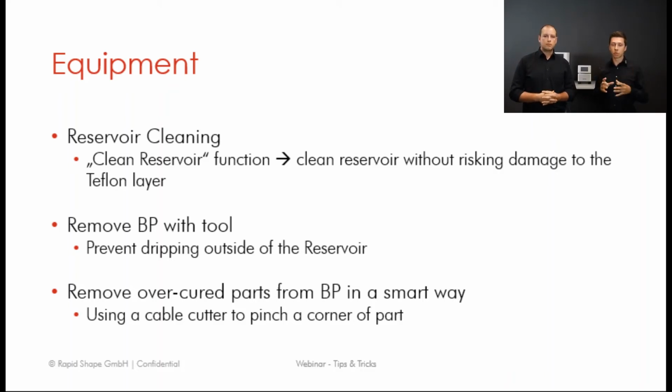If you forget, for example, to put in a platform, but you adjusted the screw too much, the load cell is not measuring the force on the back, it's measuring on the front. But the back side will collide with the reservoir, for example. So if you are adjusting something there, just get in contact with us. We will assist you to get the right amount of adjustment.